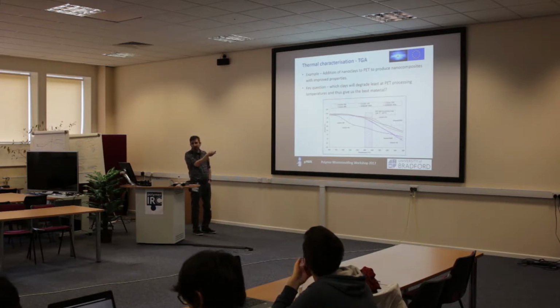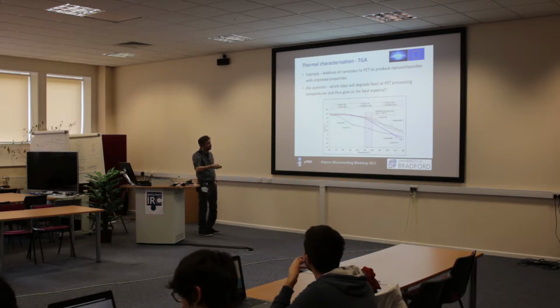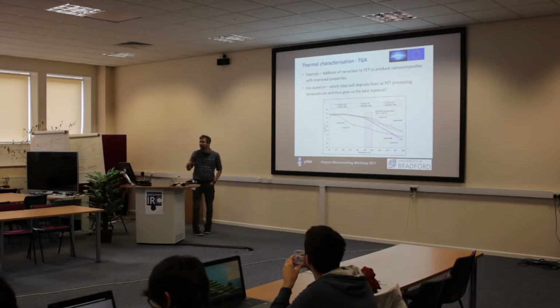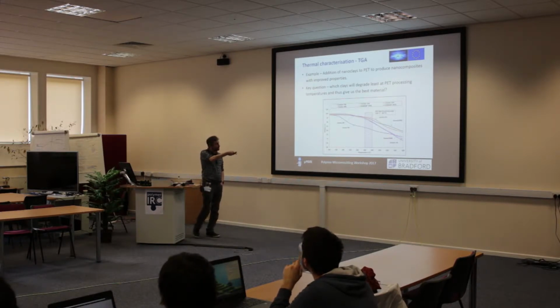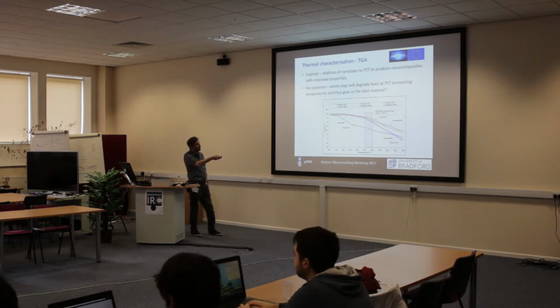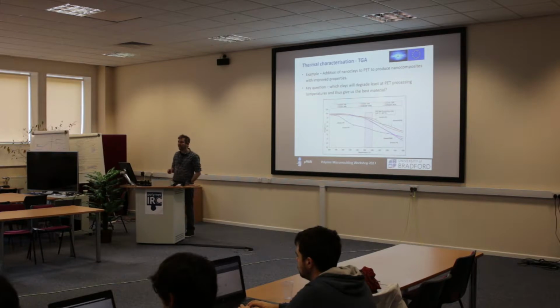Everything starts pretty much at 100%, as you would hope if you calibrate it exactly right. Simply by increasing the temperature at a certain rate, you start to see the weight drop off. That means your material is degrading massively and starting to fundamentally burn, but under nitrogen, so not burn, just degrade. We were trying to pick the right clays to start using in this section. And you see nothing is fantastic. By the time you get into the processing window here, we've lost about 8% of our clay mass.